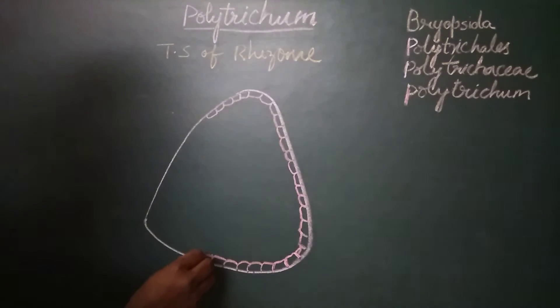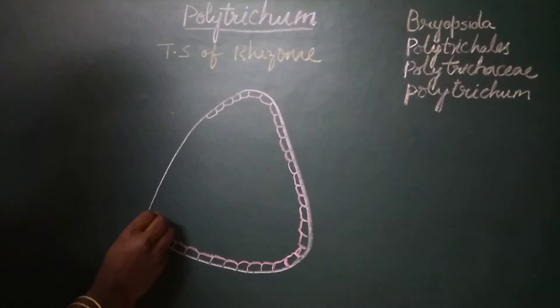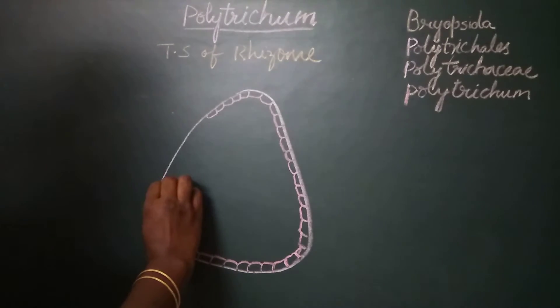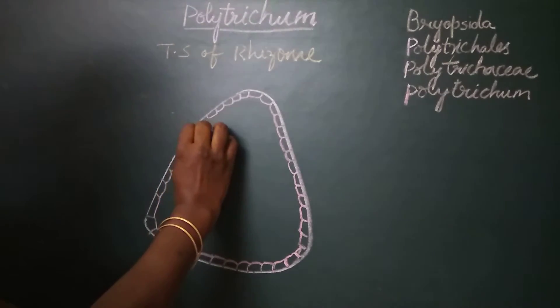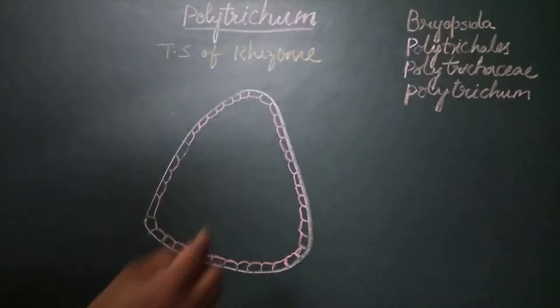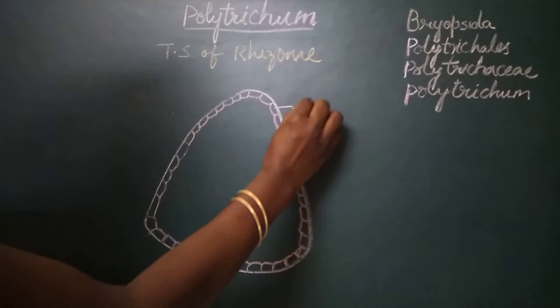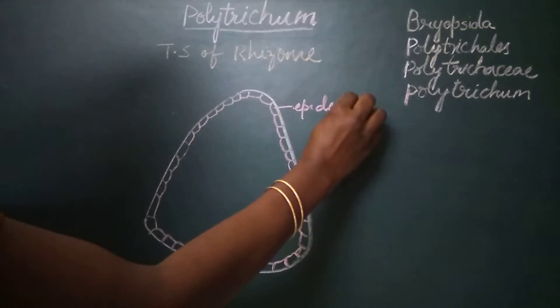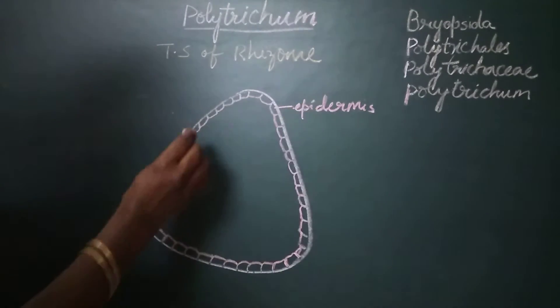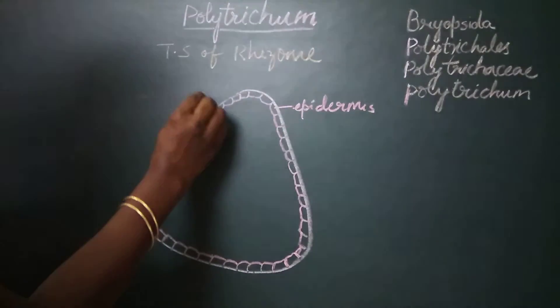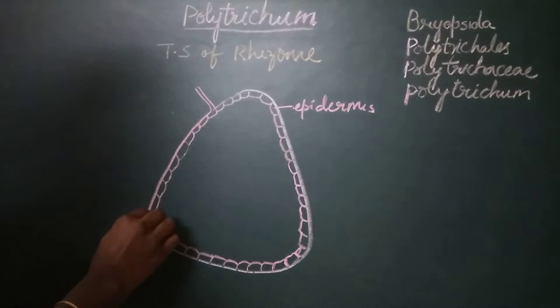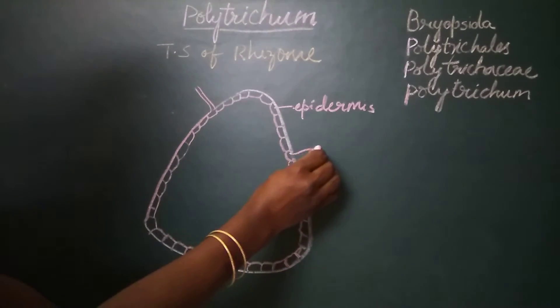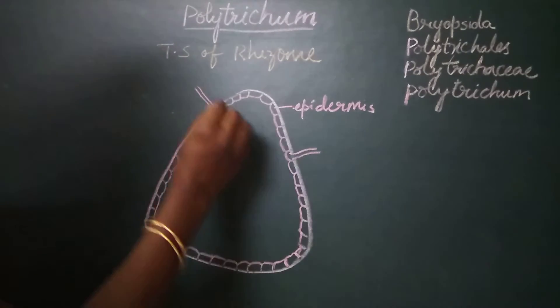Most of the epidermal cells give rise to rhizoids, so the rhizoids are epidermal in origin. This is the outermost layer which is the epidermis, and from the epidermis you can see the rhizoids emerging out. These are the rhizoids.